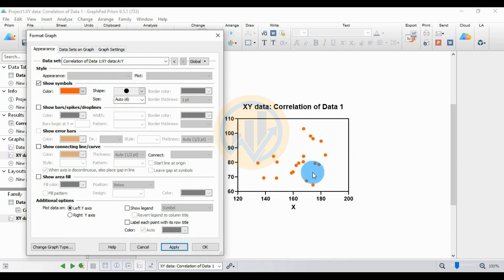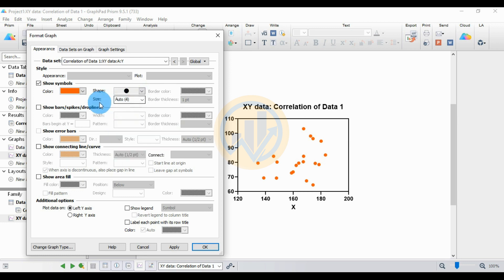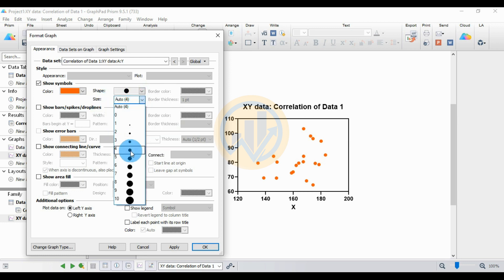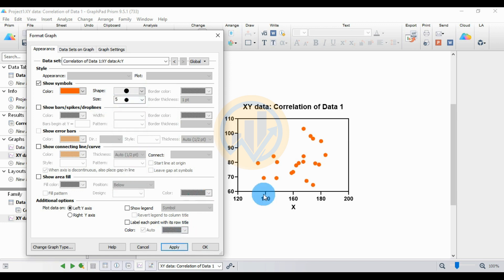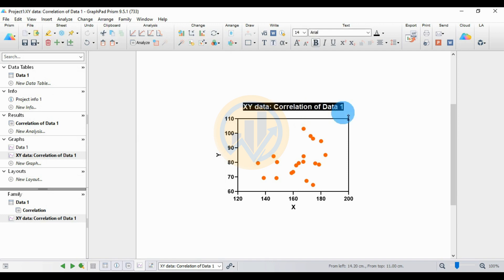Save the symbol settings. There are many symbol options available in GraphPad Prism. I will set the symbol size to 4, then increase it to 5, and click Apply to update the symbol size.